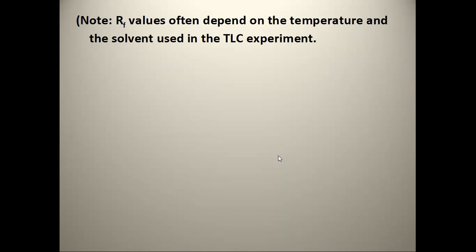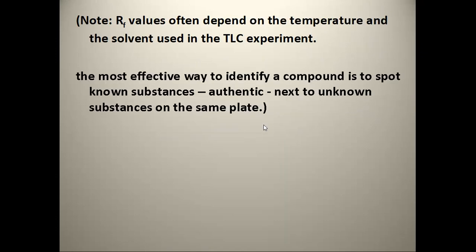So maghanap ako ng mga experiments na simulation to explain to you how RF values are calculated. So RF values often depend on the temperature and the solvent used in the TLC experiment. So similar to paper chromatography. So the most effective way to identify a compound is to spot known substances.